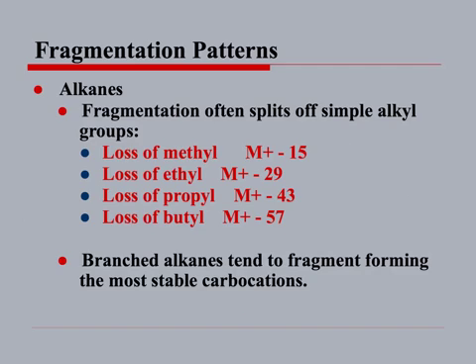So now, just going back, if you see a 15, it's a methyl group. 29, ethyl group. Propyl is 43, butyl is 57. So if you see these numbers on the molecular weight mass spec, then you can identify these peaks by these fragments or these molecules.